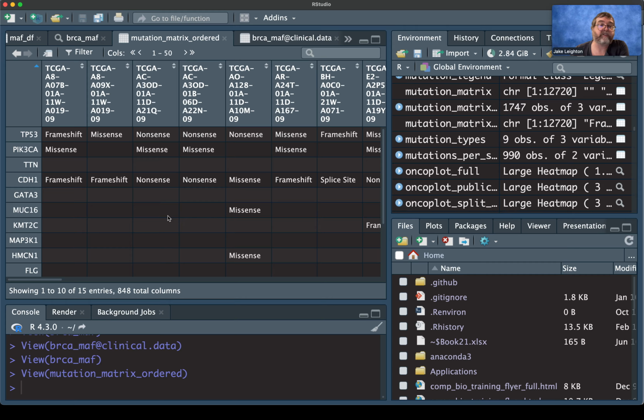We'll worry about that next time, because you can plot and cluster this and find different clusters of genes too. That's definitely one of the next steps. But let's first just make the oncoplot. What's cool is you have it in the format now, and if you have this format, you can do complex heat map stuff. You can do anything.